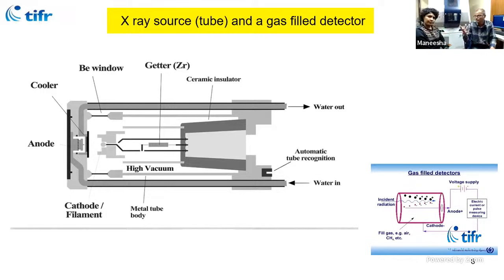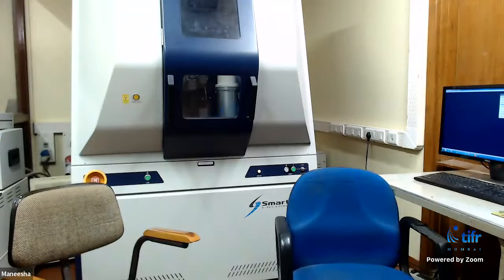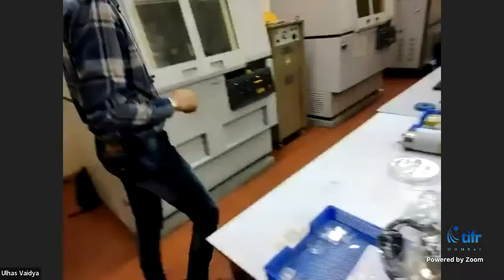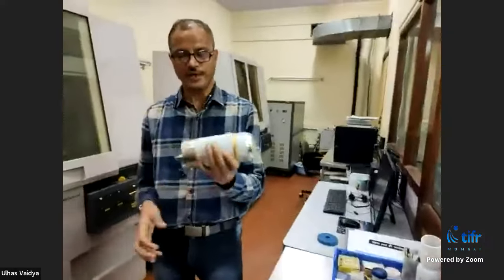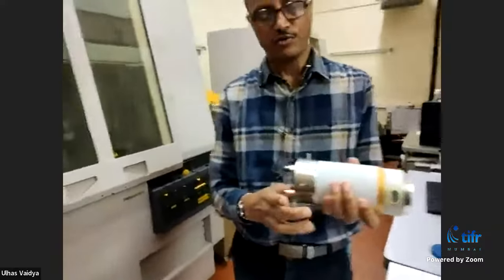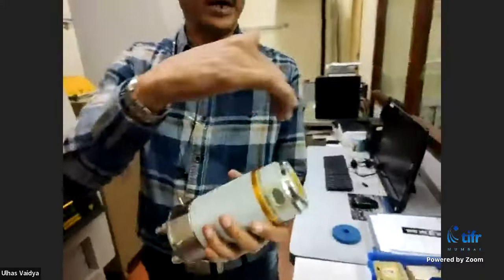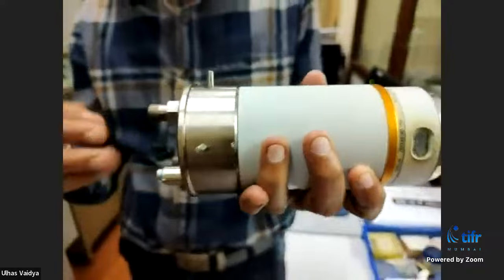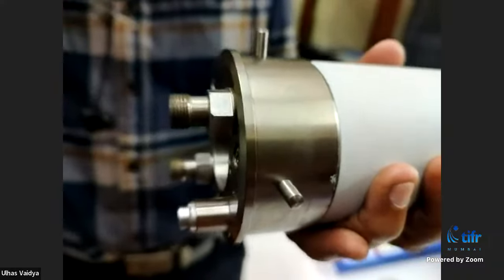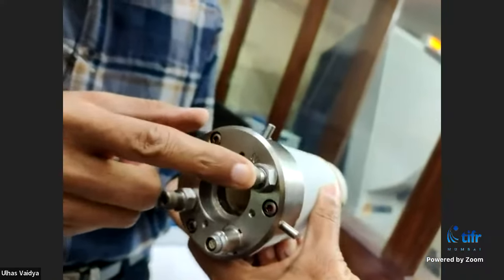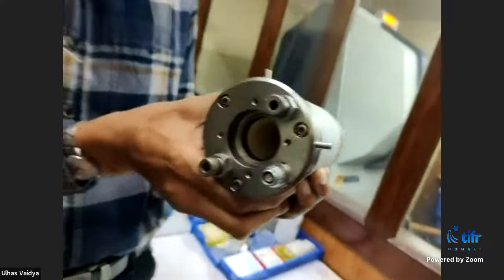We will go to the X-ray diffractometer to see how this works. This is the X-ray tube in which we generate X-rays. There is a copper target at one end where electrons strike. There is an electrical cable for the high voltage plates, a tungsten filament, and a cooling arrangement — the target is cooled using water. This is the X-ray generation tube.